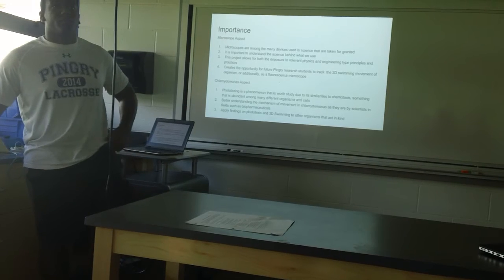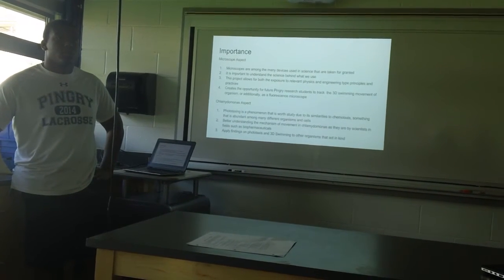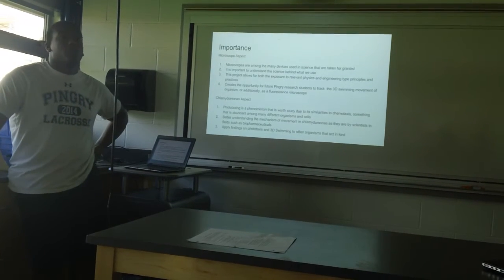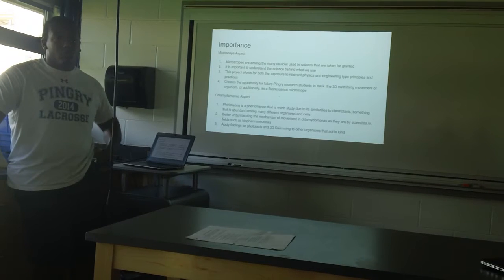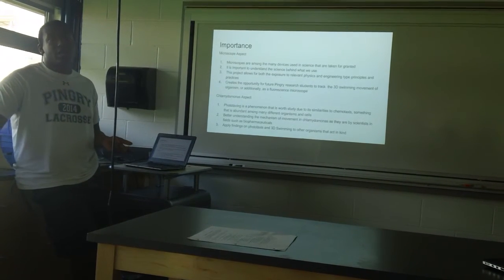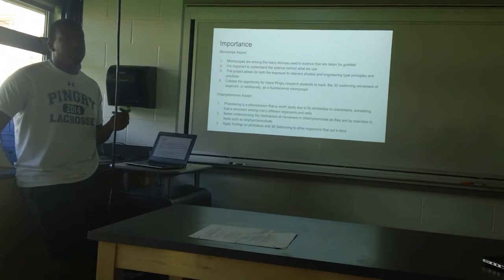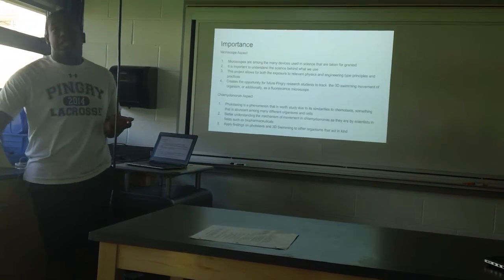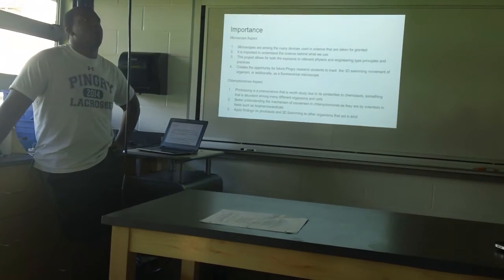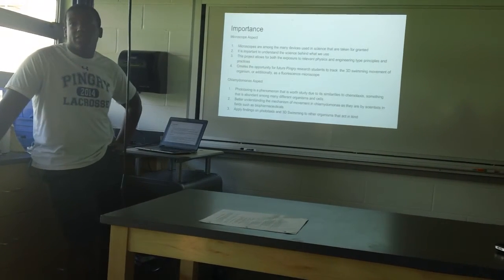The construction of a 3D microscope is something that there's nothing available for. So part of this is experimental, really just to build a 3D microscope. But phototaxing is also an interesting process that's done by algae, and it's very closely related to chemotaxis, which is very relevant among cells. It's understood in some respects, but still has stuff left to study.